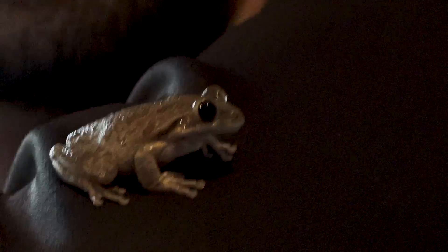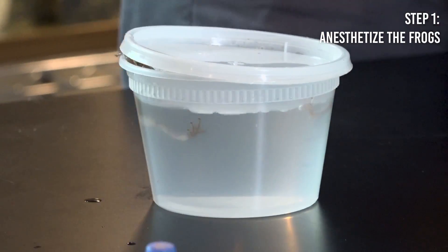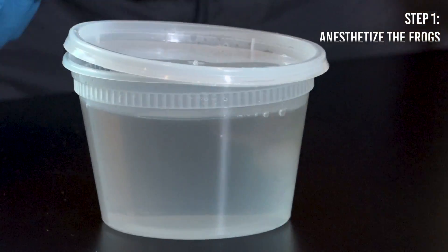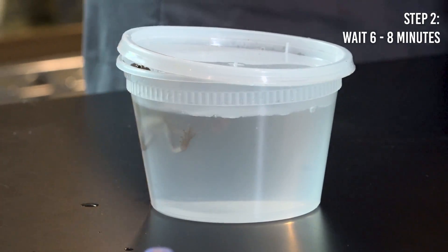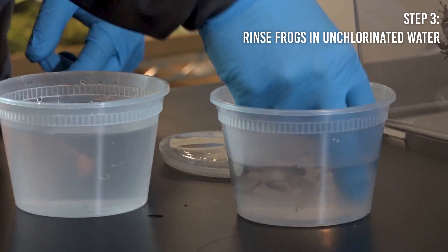The first thing we have to do is anesthetize the frogs so that they don't feel any pain. We're going to wait just a couple minutes and after that rinse them off in some non-chlorinated water.